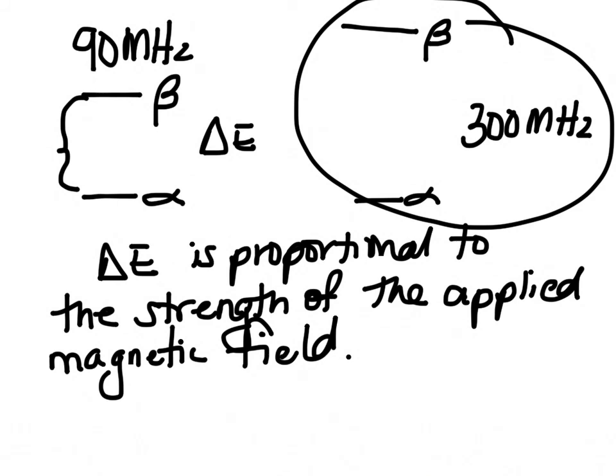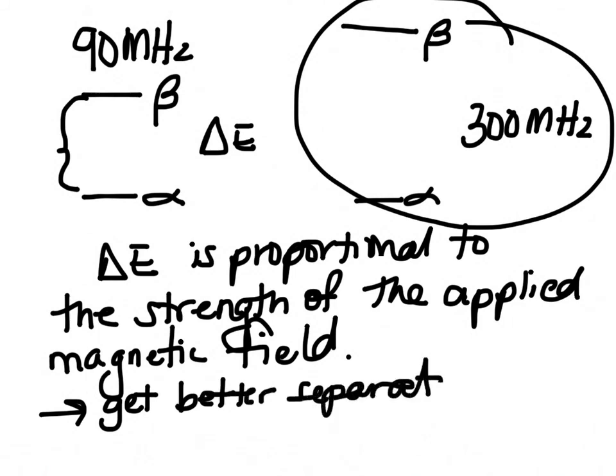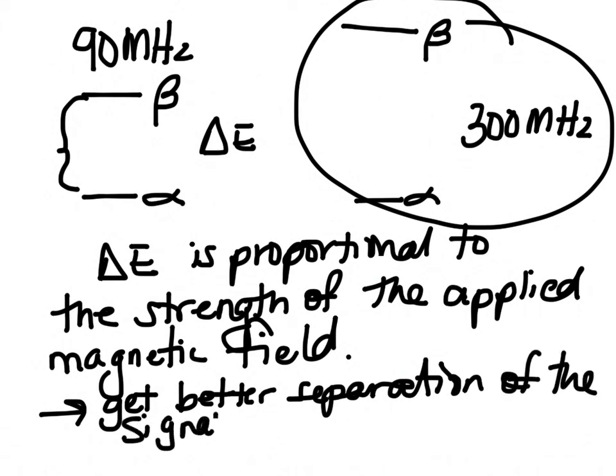What this means is that you can get better separation of the signals with a stronger magnet.